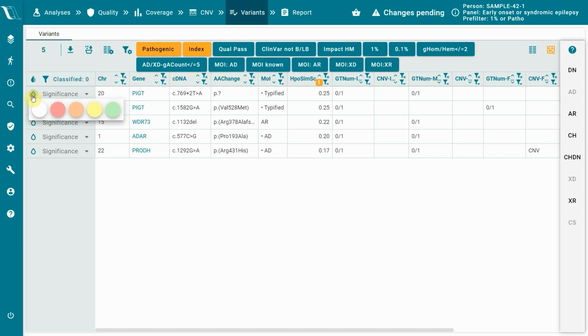And now I can choose to just highlight these variants and not look into them further and come back to them later. But like I said, this is only the first step, and every step from my workflow, I will be able to save to a report basket, such that I keep a log of all the steps.